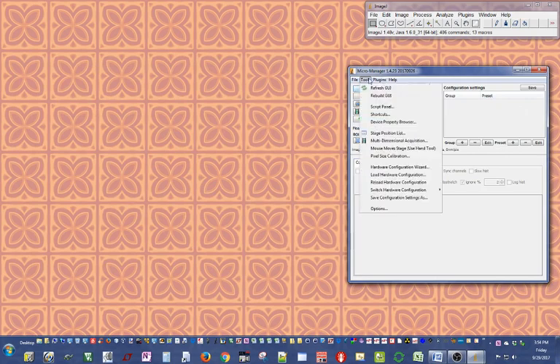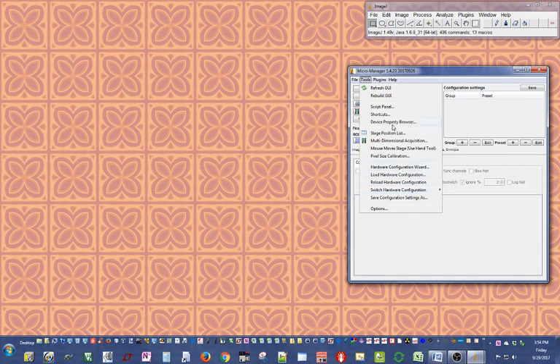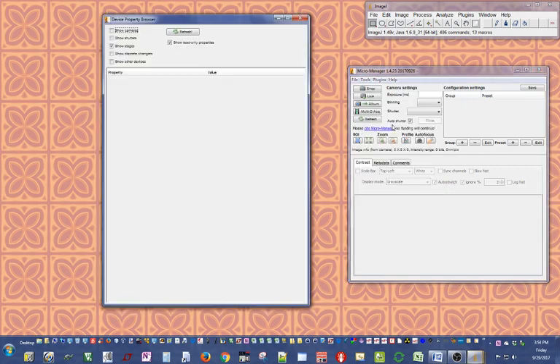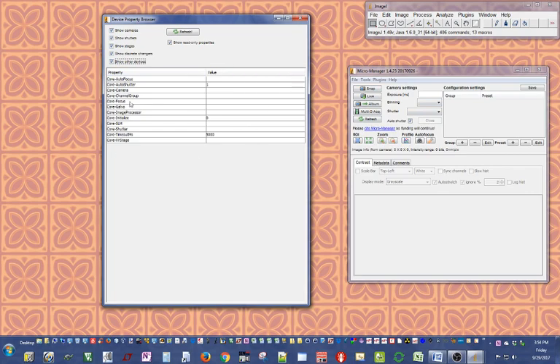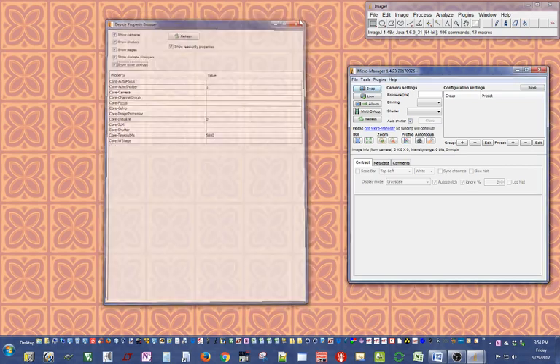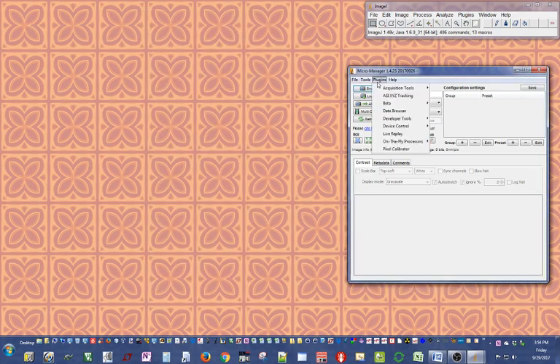What the hardware configuration wizard does is it loads up any devices that you want to use with MicroManager. Without a hardware configuration file or startup configuration file, MicroManager doesn't load any device, so right now there's no cameras, no shutters, no stages available to us.